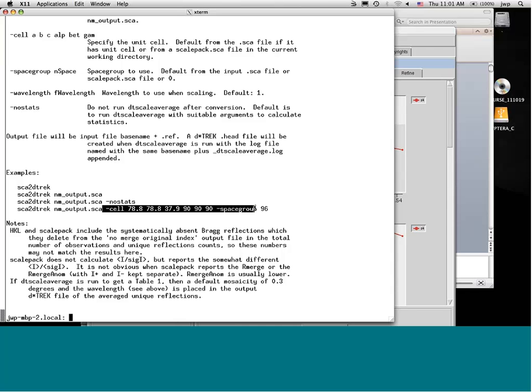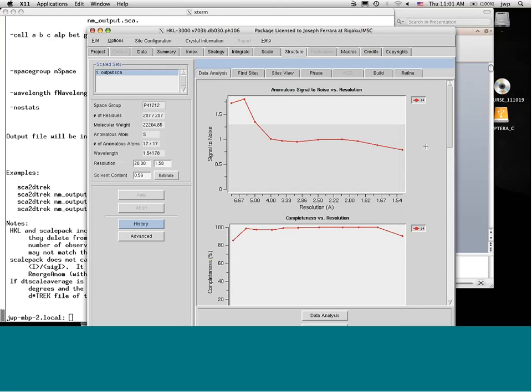Okay, great. So then just to press forward with a question from Teresa. She was hoping you could give some tips for data collected at 2.8 angstrom for using something like this for structure solution.